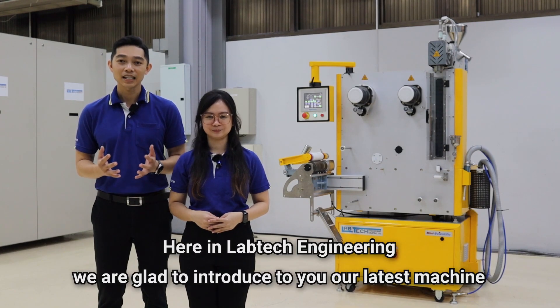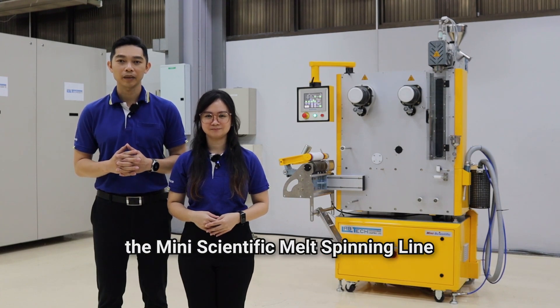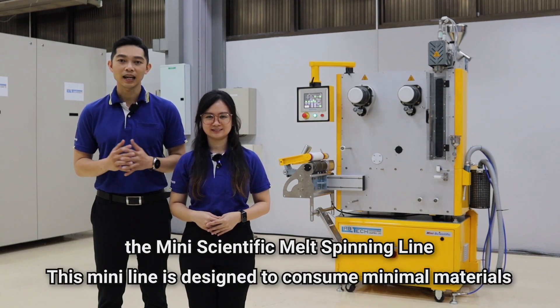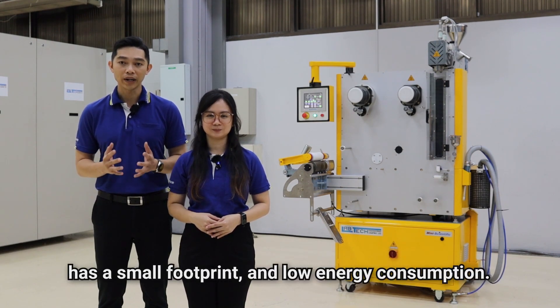Here at Lab Tech Engineering, we are glad to introduce to you our latest machine, the Mini Scientific Melt Spinning Line. This mini line is designed to consume minimal materials, has a small footprint, and low energy consumption.